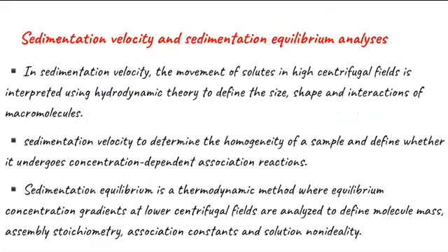Sedimentation velocity and sedimentation equilibrium analysis. In sedimentation velocity, the movement of solutes in a high centrifugal field is interpreted using hydrodynamic theory to define the size, shape, and interaction of macromolecules. Sedimentation velocity is used to determine the homogeneity of a sample and define whether it undergoes concentration-dependent association reactions.